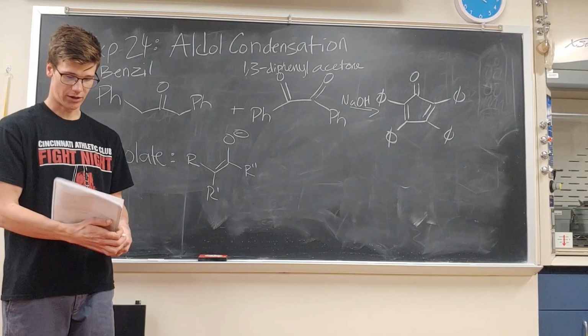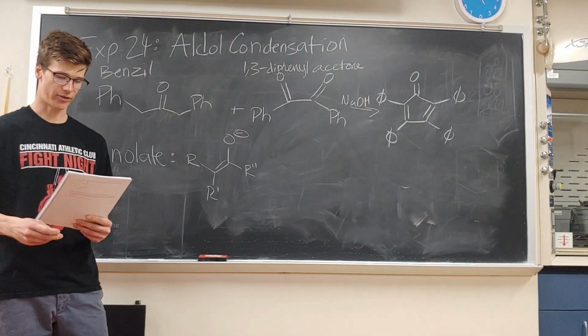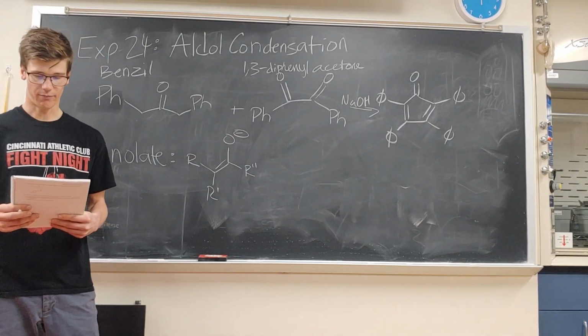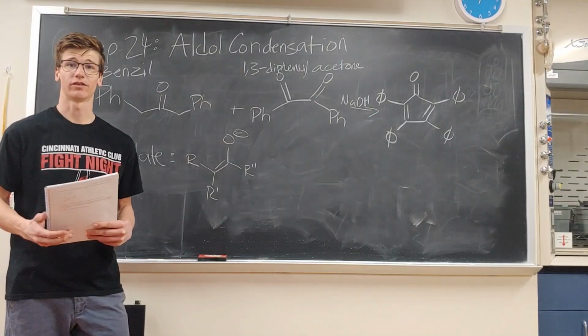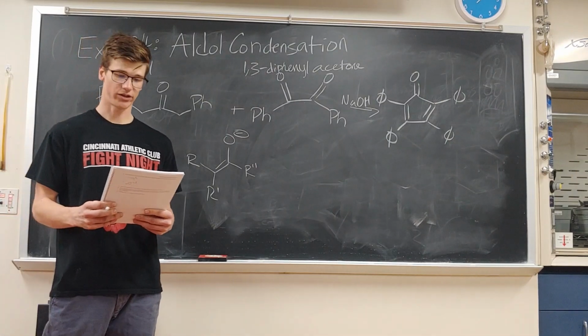Other than that, once you do your reaction, you're going to recrystallize it out using ethanol and toluene, and then you'll submit that product for an NMR and do a melting point as well. Be sure to watch the video so that you can see where the melting point is going to be, so that you can record it and use it for your own observations.